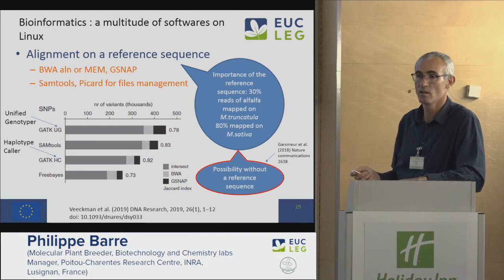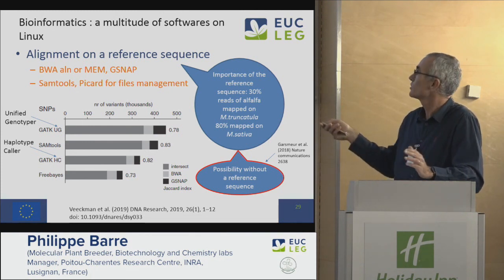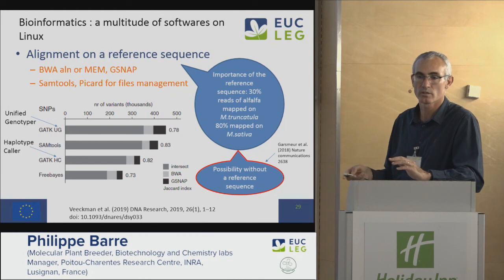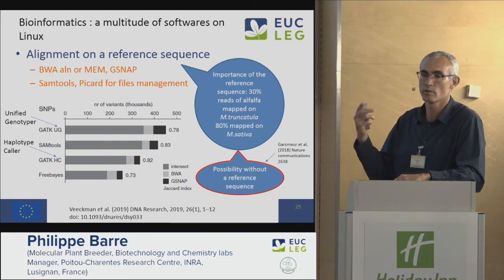So depending on the software you use, you have quite a lot of common SNPs, but still some of them are different. So maybe you want to do something with that. Usually you want to compare. So at least you have to be aware of that.